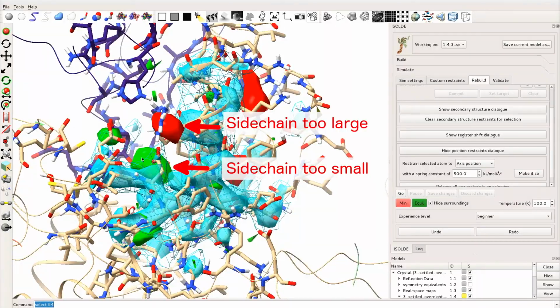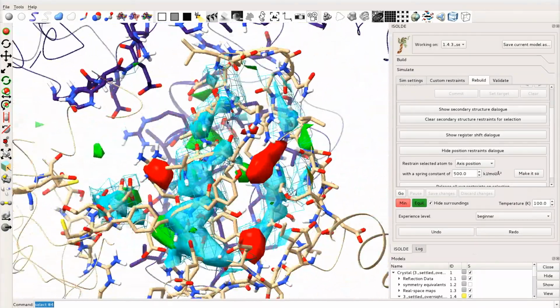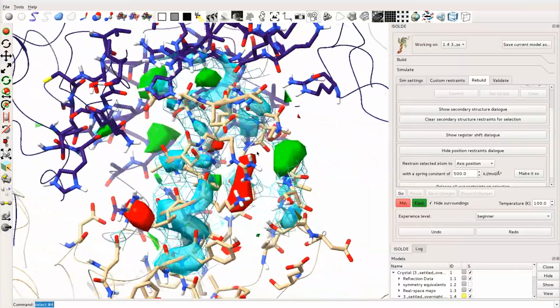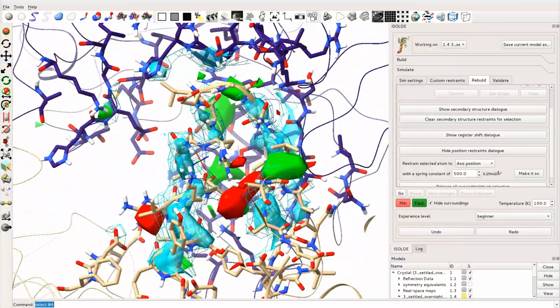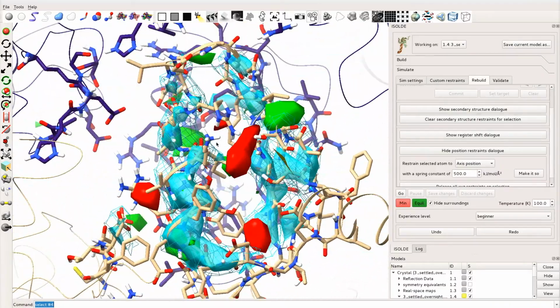In this particular case, the error traces back to a homology model used to build an earlier version of this complex into 11 angstrom EM data, and has carried through to most of the 50 structures of the same complex published since. I should note here that I have alerted the author to this and other issues I found, and shared my final refined coordinates.